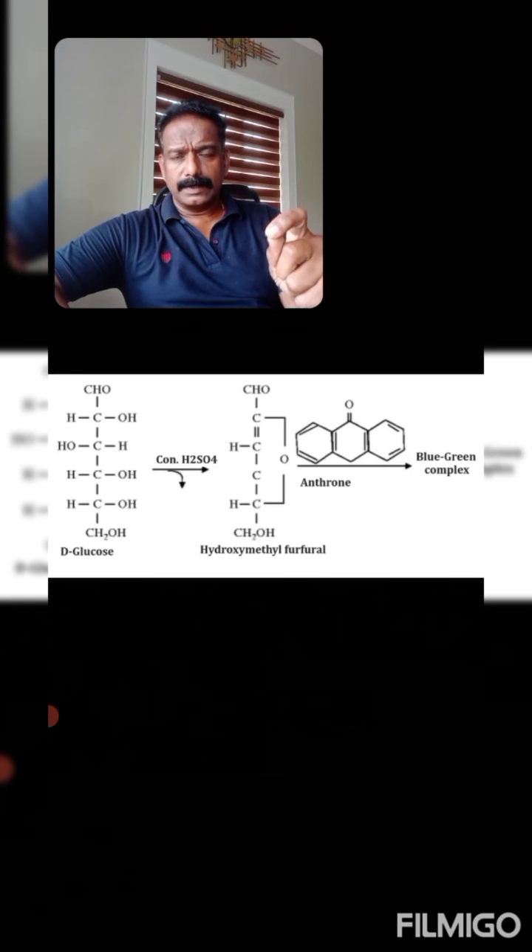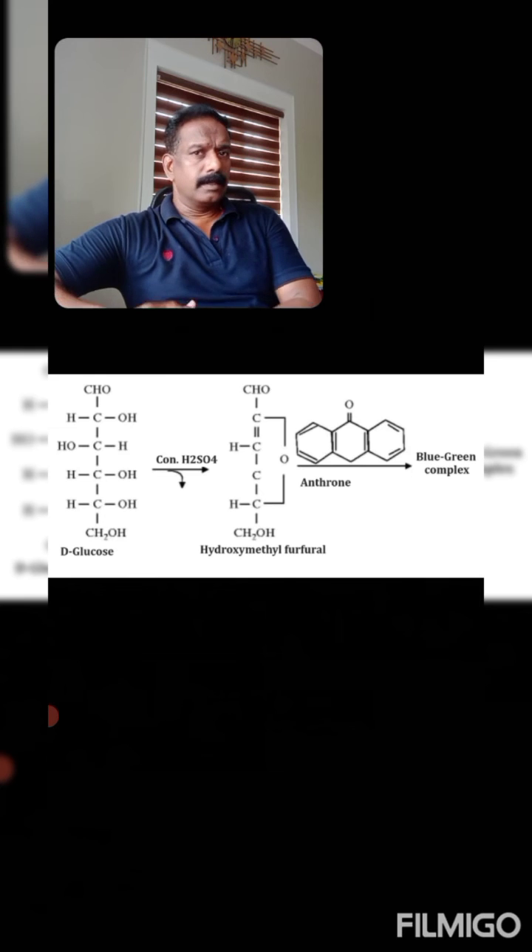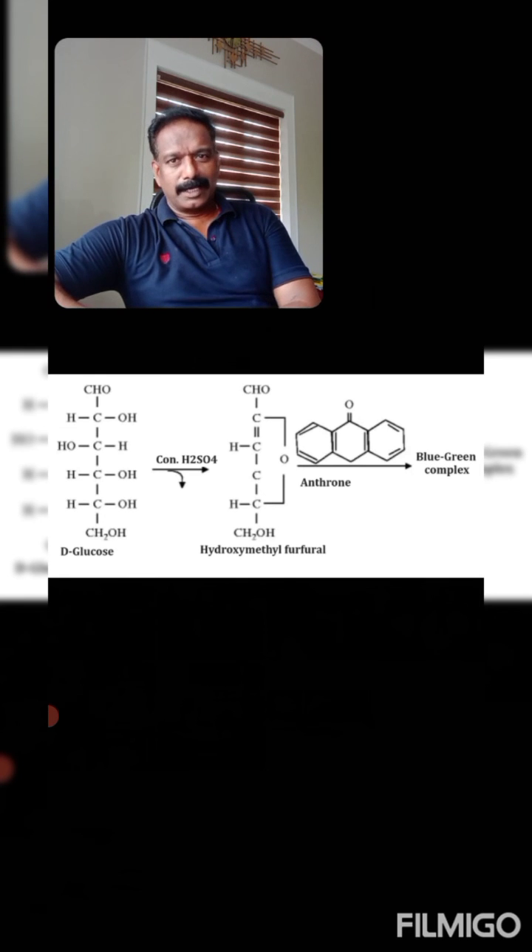This hydroxymethyl furfural reacts with one molecule of Antheron to give a bluish-green colored complex, as seen in the positive test. This concludes the Antheron test for carbohydrates.